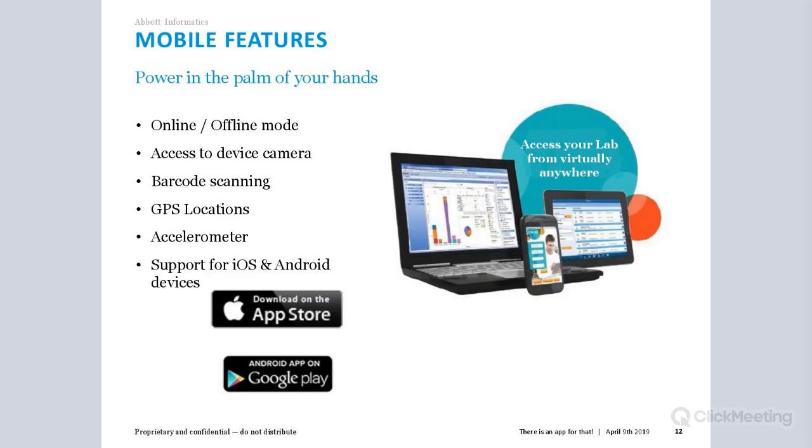It is important to note you can access the STARLIMS mobile applications from both Apple and Android devices, and the STARLIMS app can be downloaded from the platform's respective app stores.